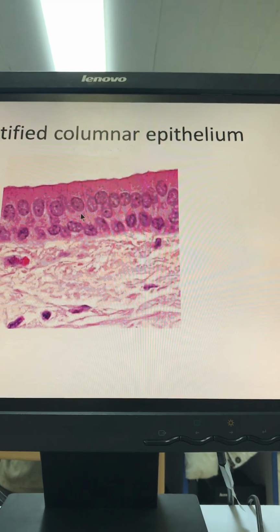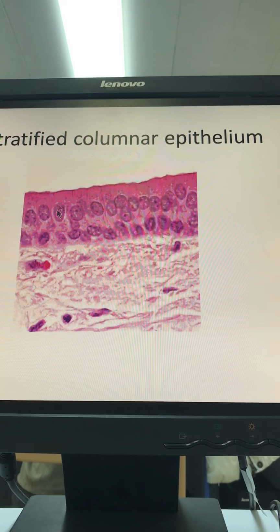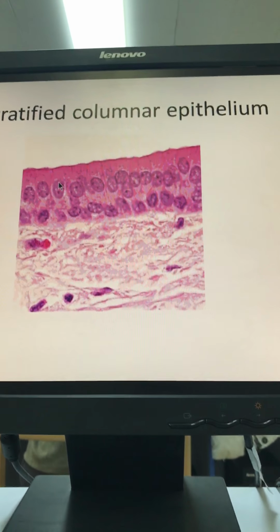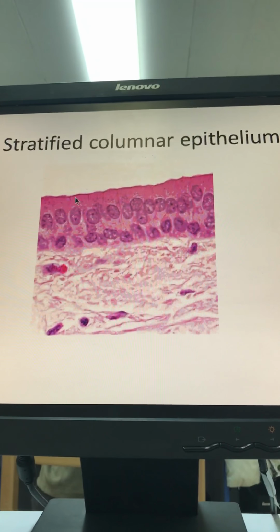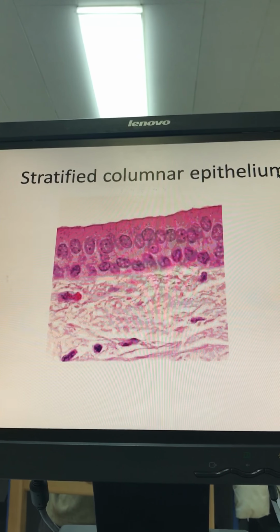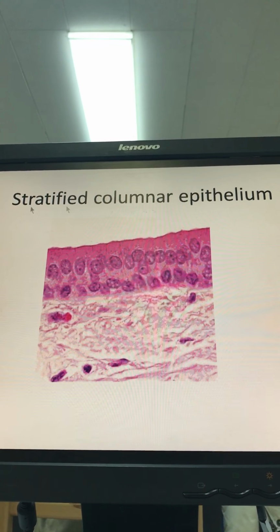I have elongated cells, okay? مع ان النيوكلياي مبينين كأنهم rounded, okay? هي واحدة كثير واضحة elongated nuclei. This type of epithelium is stratified columnar. Actually, the stratified columnar epithelium is rare in our bodies, okay? Rare in our bodies.